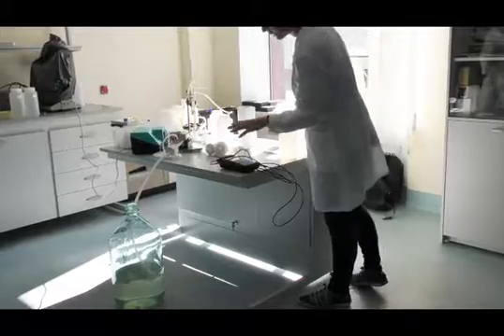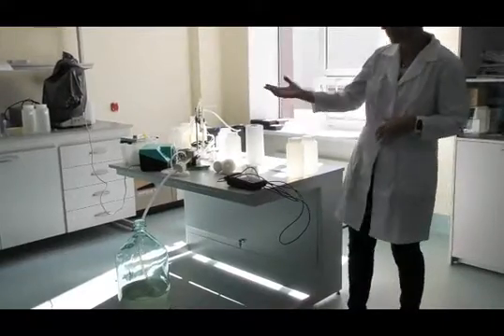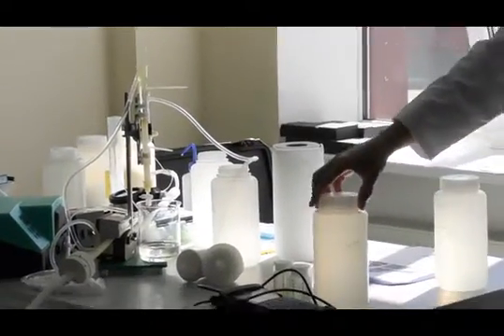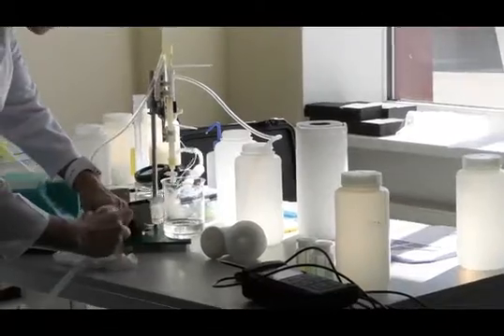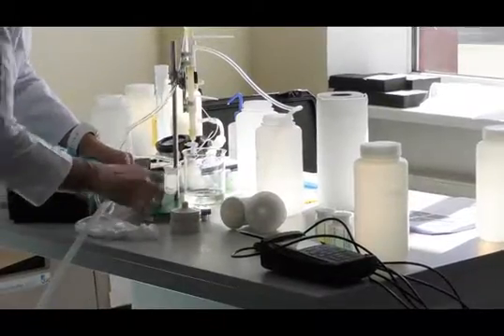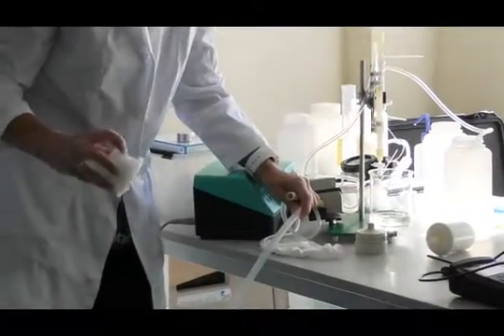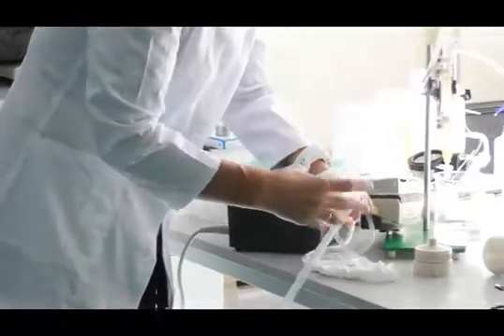We don't bother to measure the pH and so on now, and the total sampling is just to take the sample from the bottle, maybe through the pore filter, and into a bottle. We did that yesterday. I just remove this one now, but it can still be there, the pore filter for the next filter, but then it's a 0.45 filter. It has a flow direction, and that's important if you're using these housing filters. There's an arrow here saying flow, so I put it in the correct flow direction.